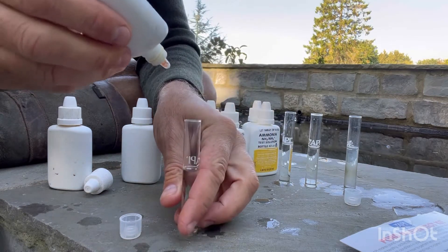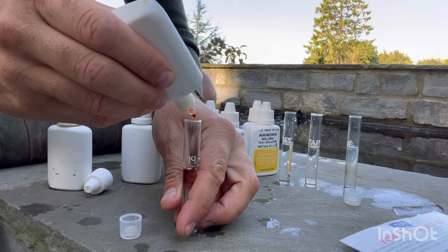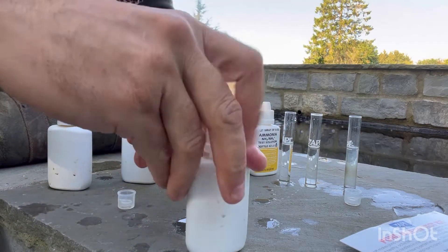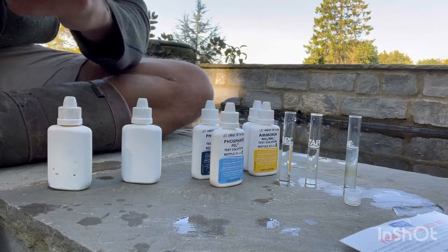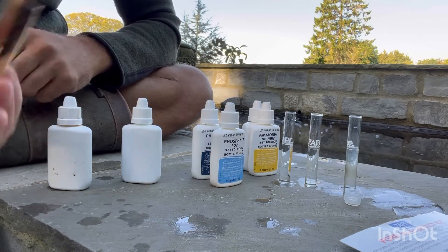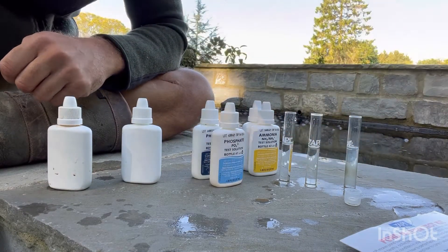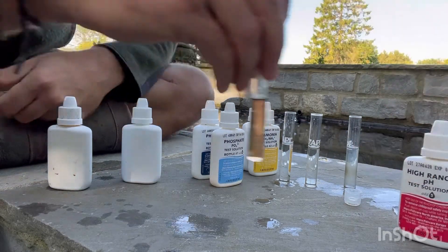So the first one — add five drops. Lids back on always, and then remove out of the way what you're not using. Lids back on clearly in case it falls over or you have an issue — you don't normally want to be dropping chemicals straight into your pond. All right, so that's the first one: high range pH.